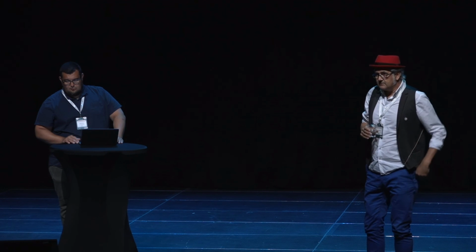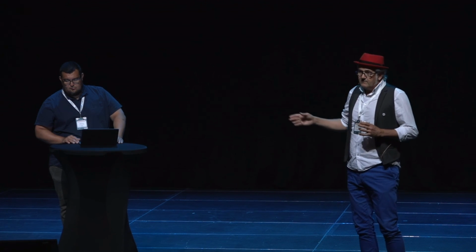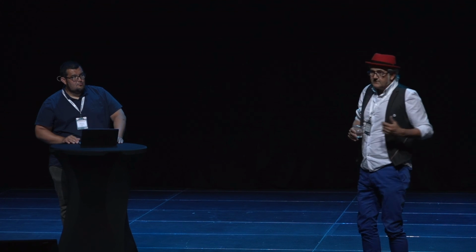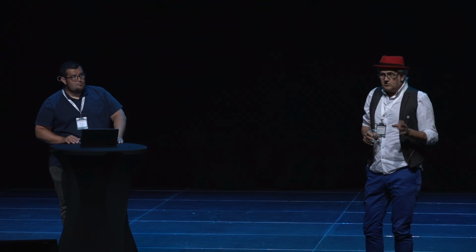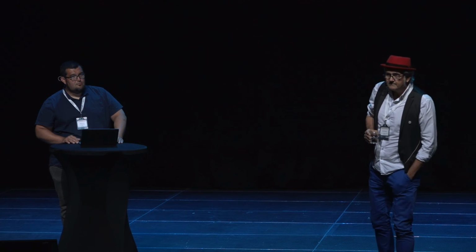We've talked to them, and that would just not be feasible. You still would need a different graphic user interface for the camera. So the short answer is, in a single user environment, go for Fiji, ImageJ, and SRRF. If you have a multi-user environment, this seems to be the better solution. That was our main driving purpose for it.